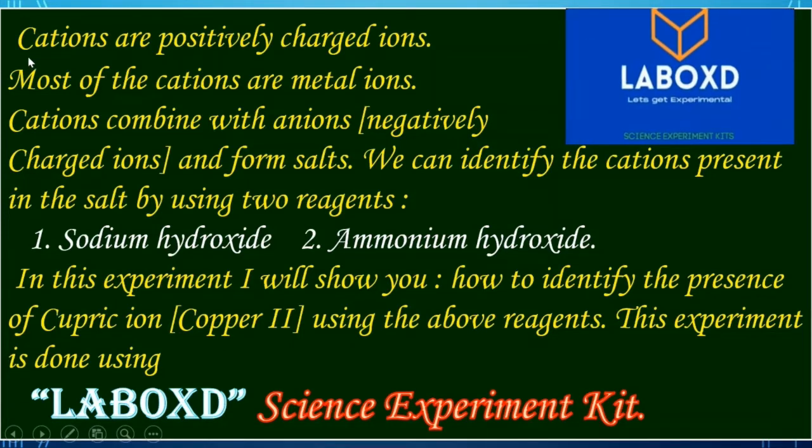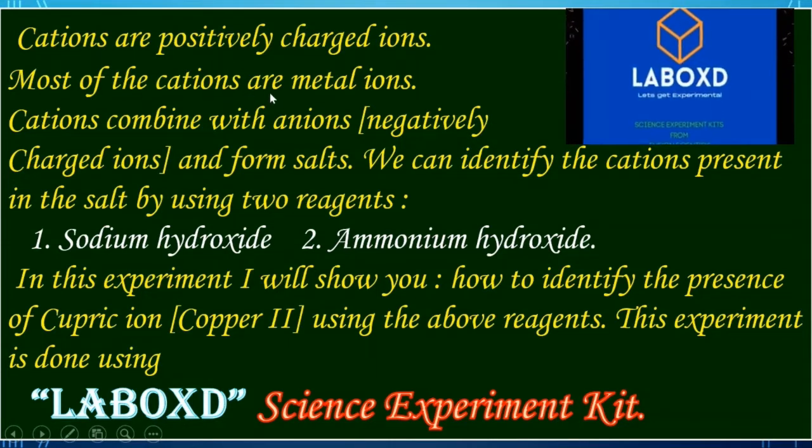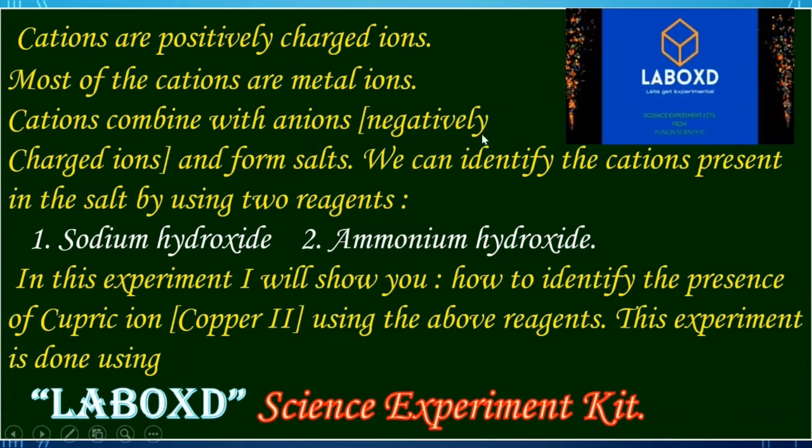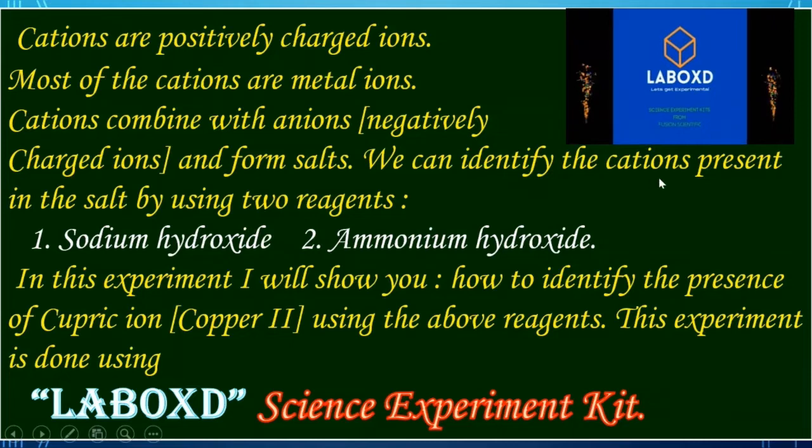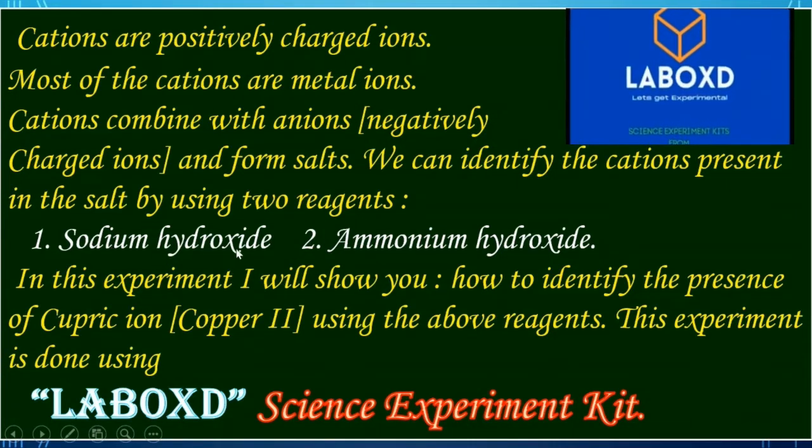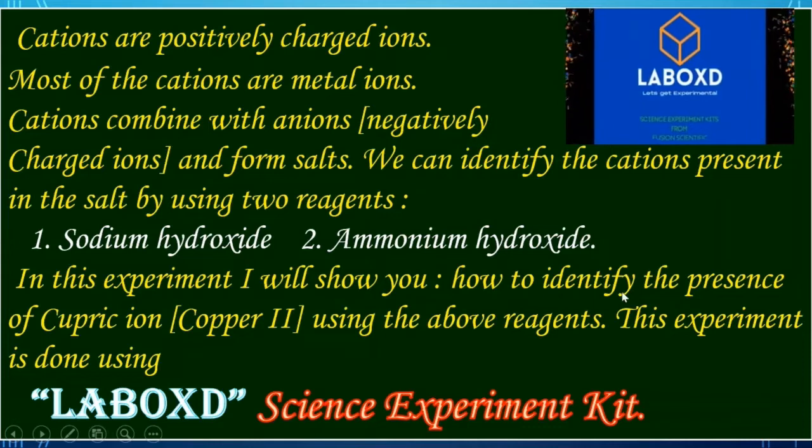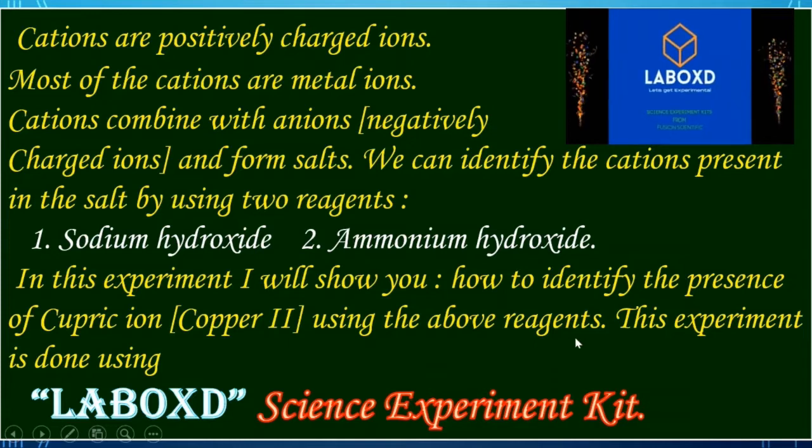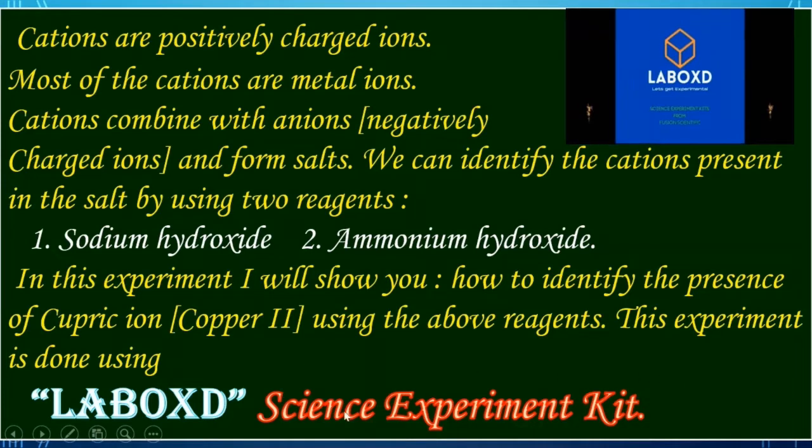Cations are positively charged ions. Most of the cations are metal ions. Cations combine with anions, that is negatively charged ions, and form salts. We can identify the cations present in the salt by using two reagents: sodium hydroxide and ammonium hydroxide. In this experiment, I will show you how to identify the presence of cupric ion using the above reagents. This experiment is done using Labox D's experiment kit.